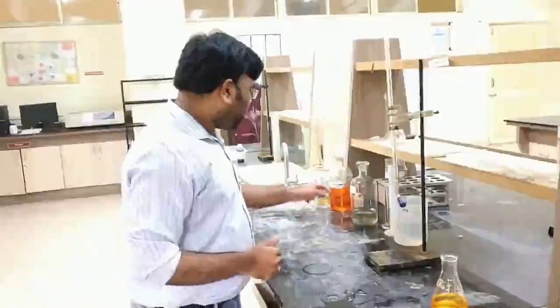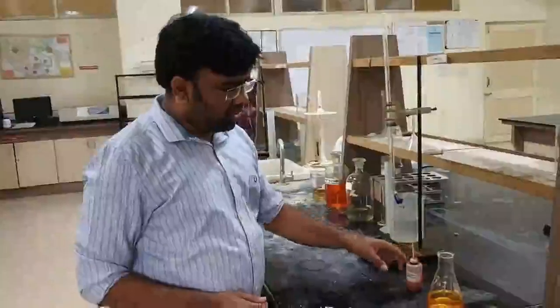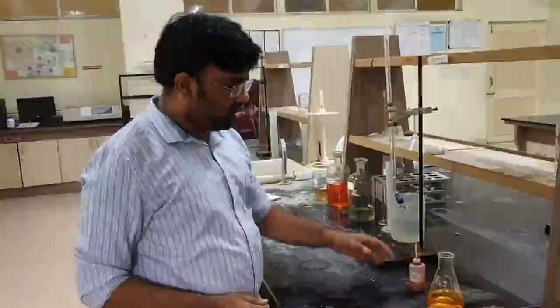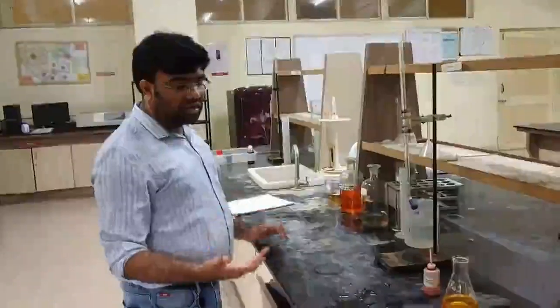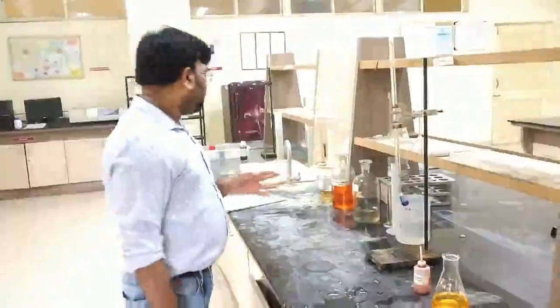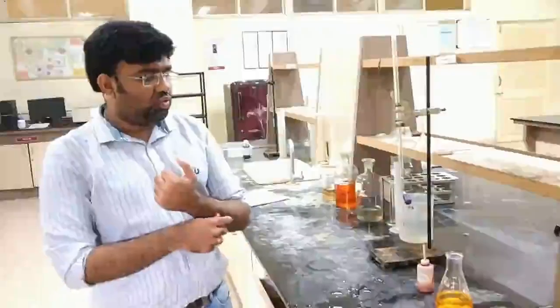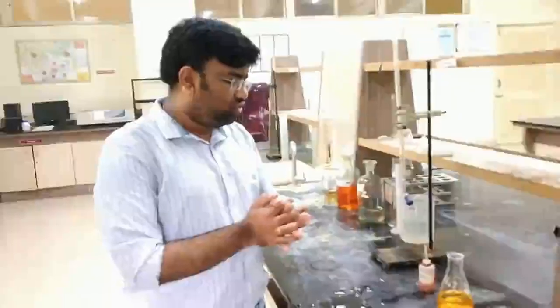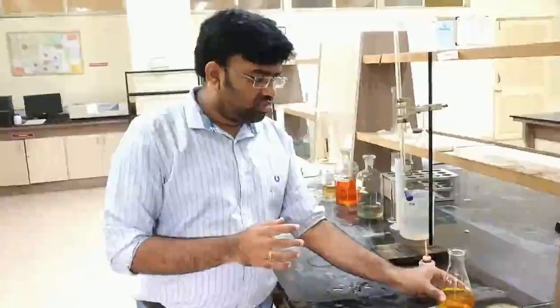When we start the titration, we are going to add the ferroin indicator here. When we add this ferroin indicator, you'll get a dark green color, and the end point of this titration is a stable brown color precipitate, right? So we are going to achieve that particular color. So we are going to wait till it gets cool.